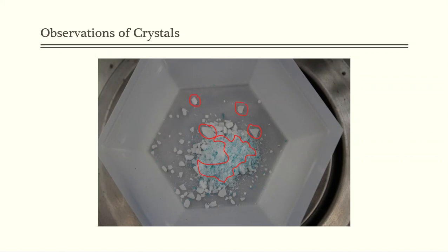And this is a very good sign that it is crude. I do not want my product in a laboratory to look that dirty, filthy, and disgusting. We don't like filthy things in a lab, right? So I want something that looks a little bit better, a little bit prettier, a little bit more textbook. So I want you to keep this image in mind. This is what the crude product looks like.